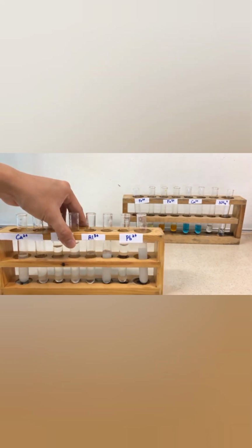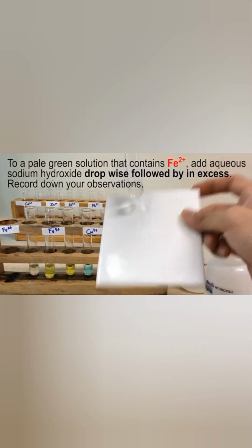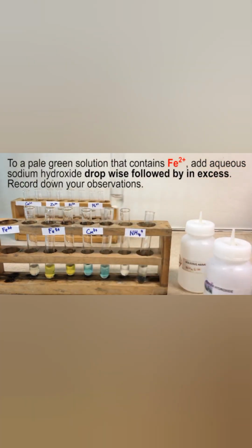The white precipitate remains insoluble. Okay, let's go over to iron 2 and iron 3, plus copper, as well as ammonia.